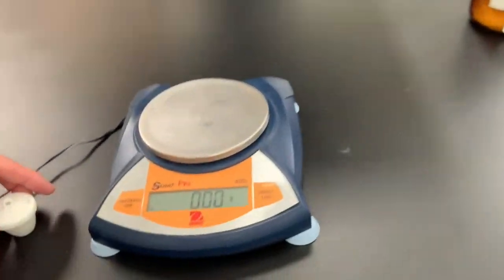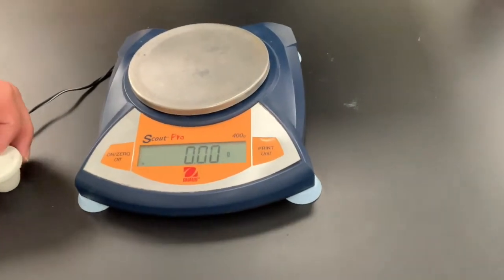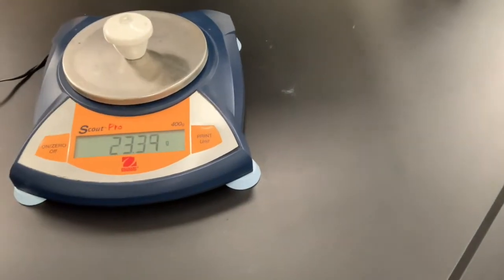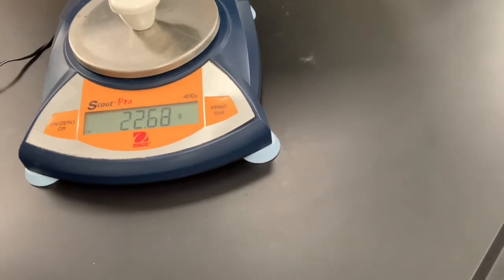First step, you want to weigh your crucible and lid. Hopefully your balance reads zero and we'll put that on there, and you want to write that number down.